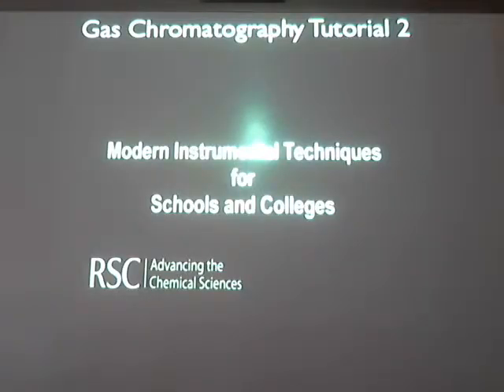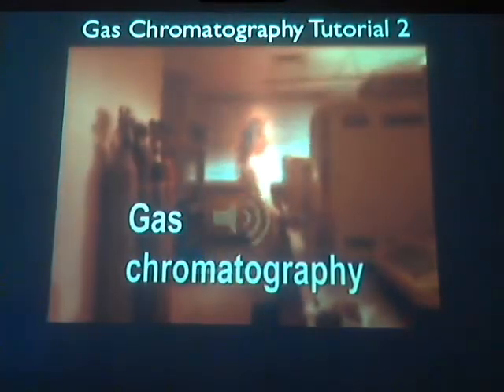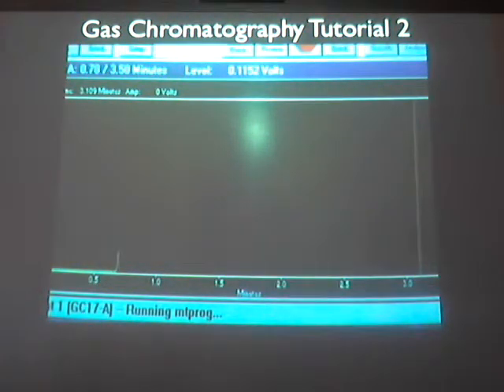This was a better one. Gas chromatography, GC, is a method of separating mixtures and is particularly suited to mixtures of fairly volatile liquids. As in all chromatographic methods, there is a mobile phase, in this case a gas, that carries the components of the mixture over a stationary phase. In this case, the stationary phase is a tube called a column, packed with solid or coated with a high boiling point liquid. The components of the mixture leave the column in order of volatility, the most volatile first.